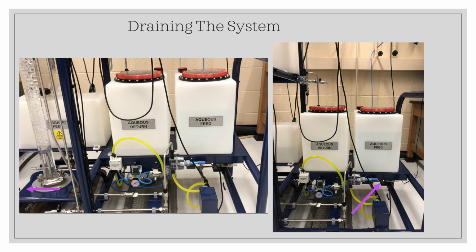The next step in the procedure is to drain the LLE column through the bottom valve into a pitcher. The valve is showing in the picture on the left with an arrow.